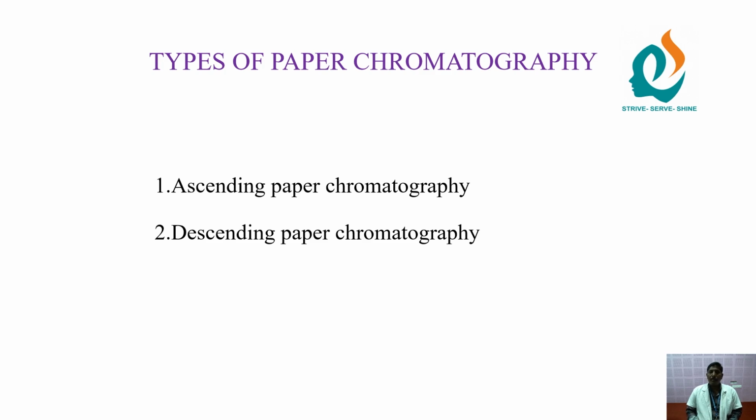Next, types of paper chromatography. There are two types of paper chromatography. One is ascending paper chromatography. The next one is descending paper chromatography.